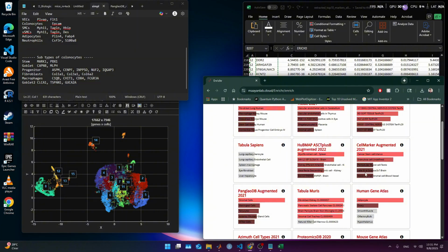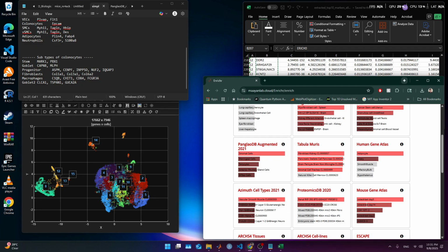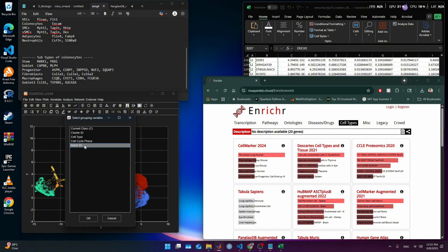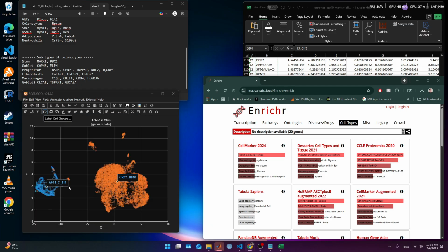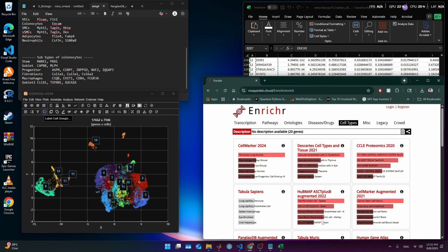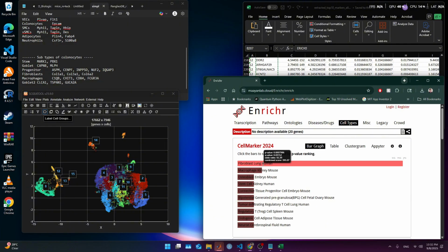Be careful. We gotta be very careful. Stromal cells. That might be potentially it. Adipocyte, fibroblast, kidney. So we come back here. I don't think it's cancer stem cell because remember, that's healthy sample. We show the batch ID. A014 is unaffected polyprogression, which is still not cancer active. So I don't think we have a reason for naming that cancer stem cell. So we reject that because I don't think it is. But it's potentially fibroblast, a different fibroblast.